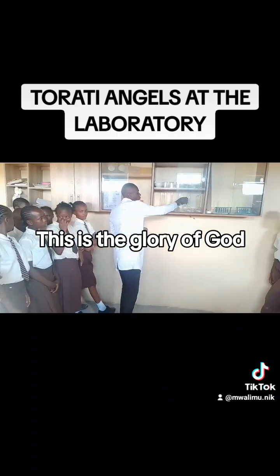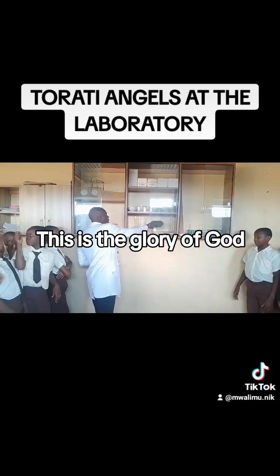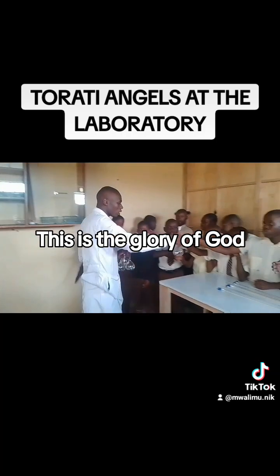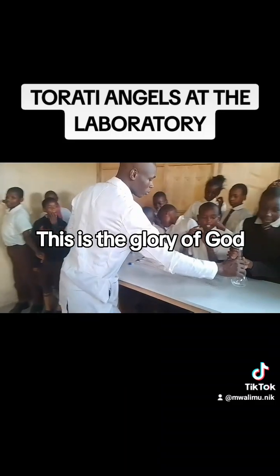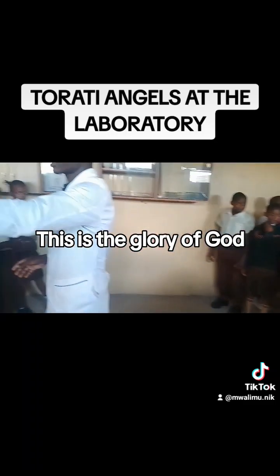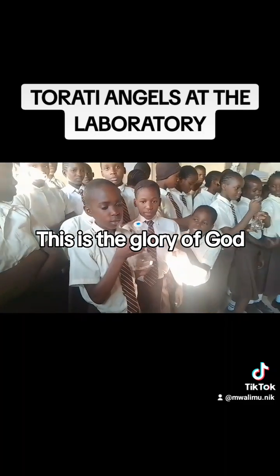So another instrument that can be used to measure volume is the volumetric flask. You need to handle them well. This one you just handle when it is on top of the desk. So that is a volumetric flask. You can have a look. That is known as a volumetric flask.